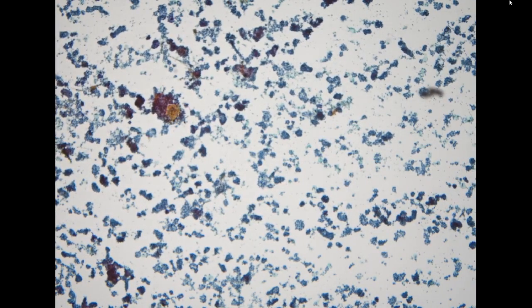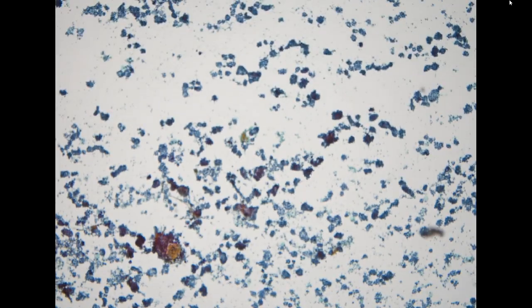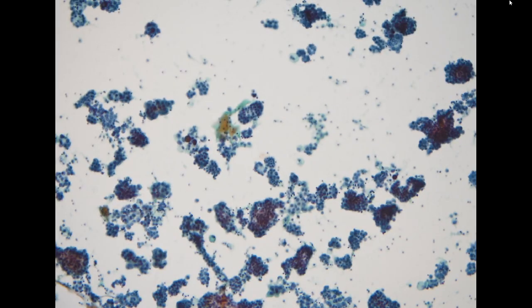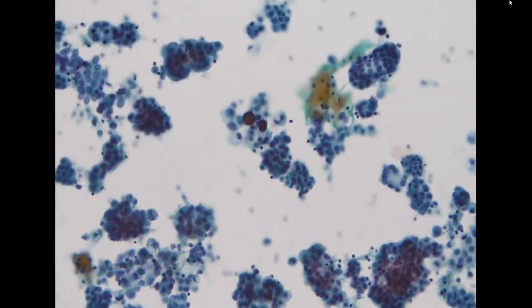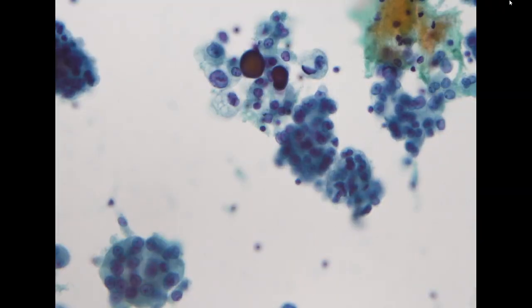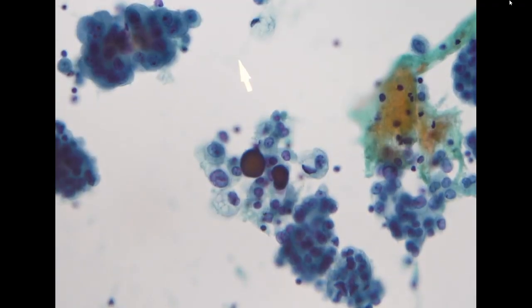Next specimen is also a pleural effusion, lung adeno. So you can see a lot of like 3-dimensional clusters. Even some, you can see here is a psammoma body.